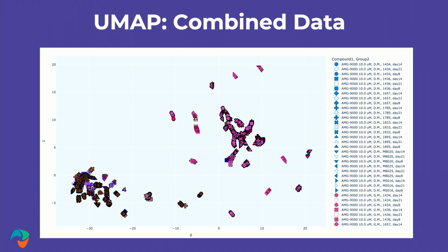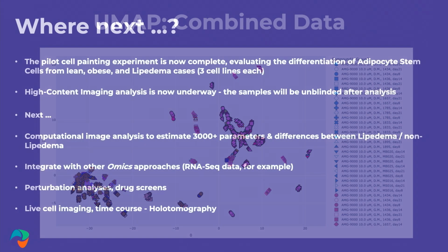And then the far away clusters that you see are maybe the different patients, I don't yet know who's who. And the distance tells you how different they are from each other. The closer they are, the more alike. The further apart the clusters are, the more different they are. So the goal of the approach is to ask who is close to whom, who looks alike, who looks different, and then try to get a handle on why they are different, and how we can move them with drugs or with other treatments from one point to another.